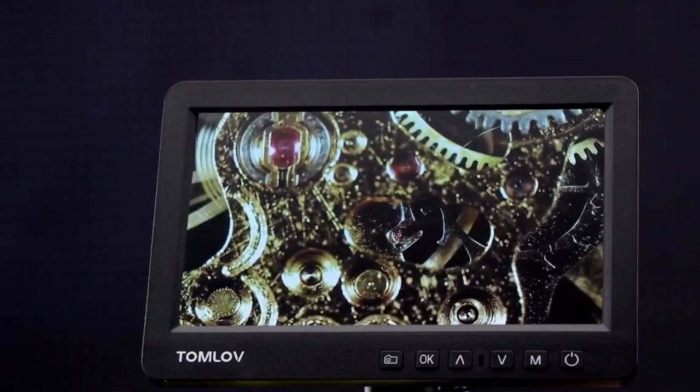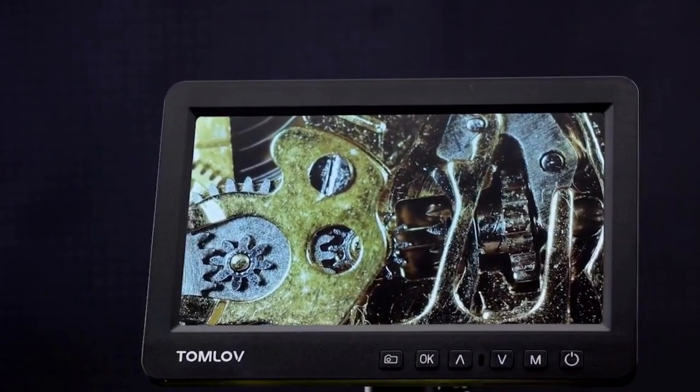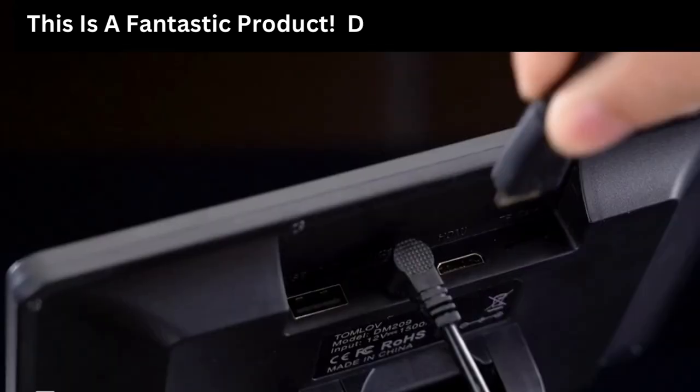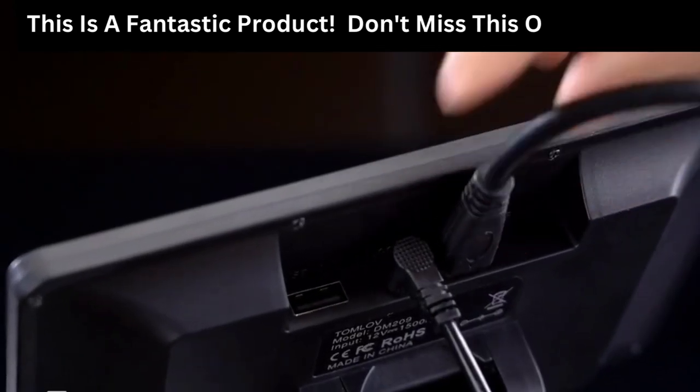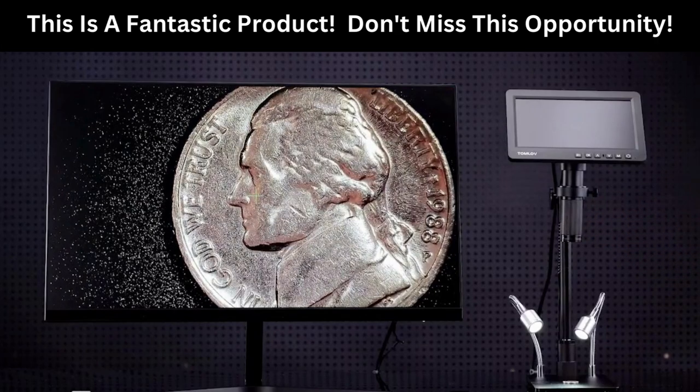Say goodbye to dull visuals. This microscope features a no-fuss IPS screen that treats you to vivid and saturated colors. IPS technology ensures accurate color reproduction from any angle, making it perfect for sharing with colleagues or friends. The expansive 178-degree viewing angles mean you won't miss any details even if you're not directly in front of the screen.